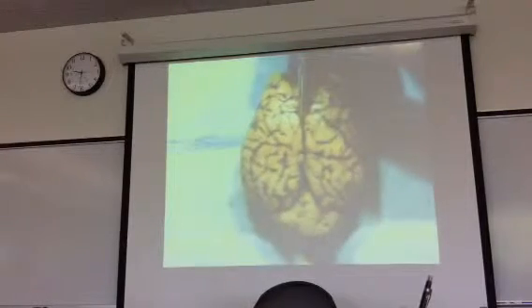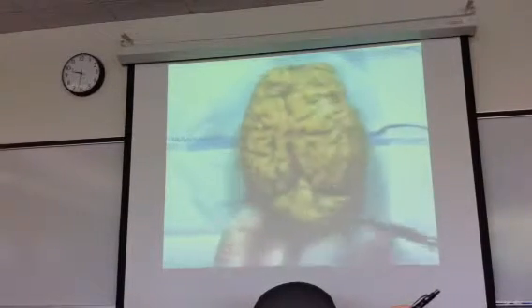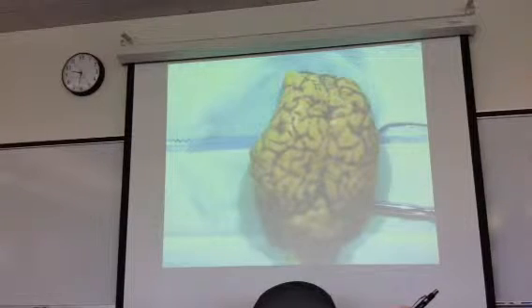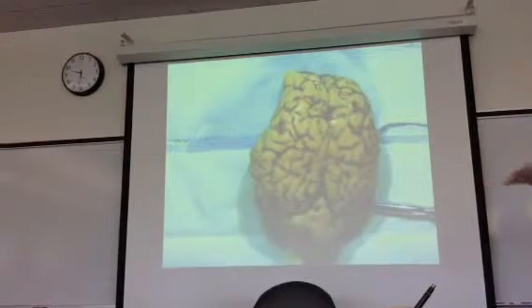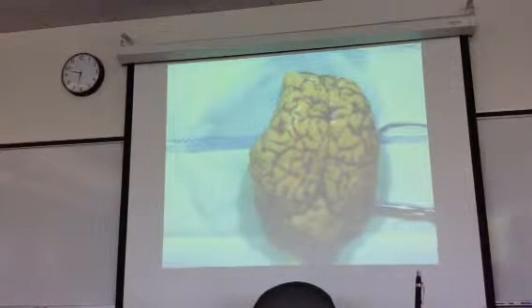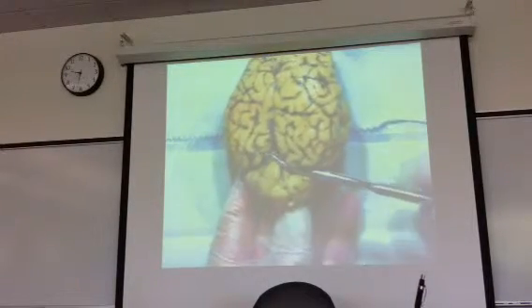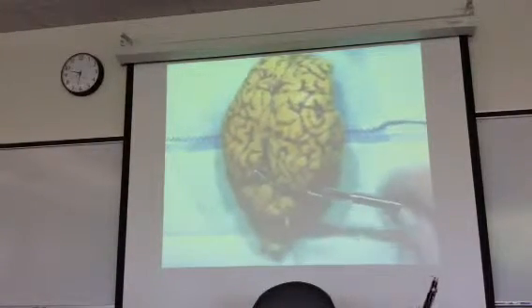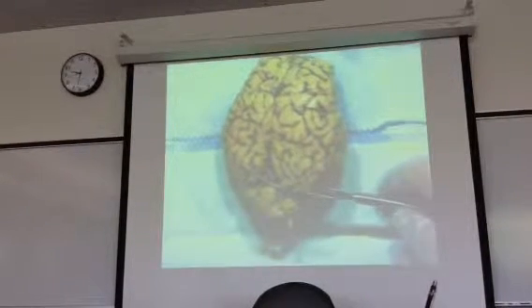See this deep groove that my probe is in now? That's the longitudinal fissure. This fissure between the cerebrum and the cerebellum in humans extends into this plane. Name this plane. Transverse. Horizontal is an alternate name for it, but I'm going to go with transverse. And this groove between the cerebrum and the cerebellum is named the transverse fissure as a result. Okay, deep groove, fissure. This one's transverse fissure.